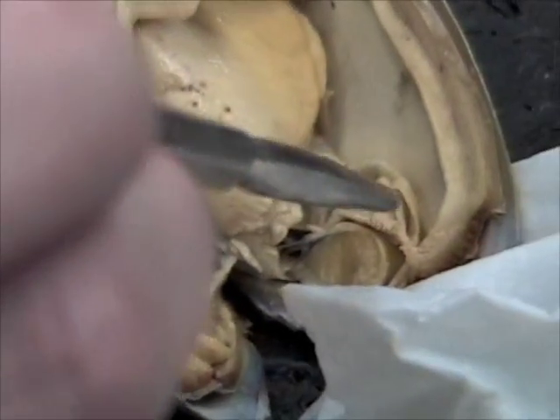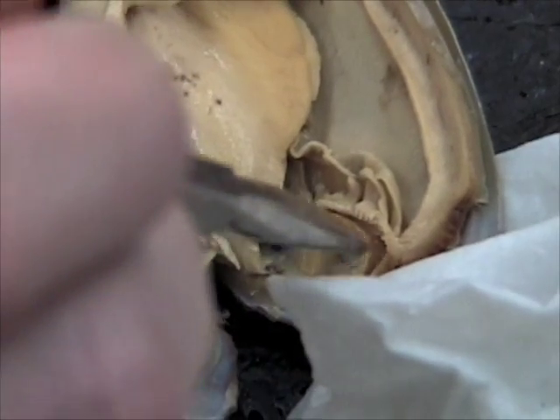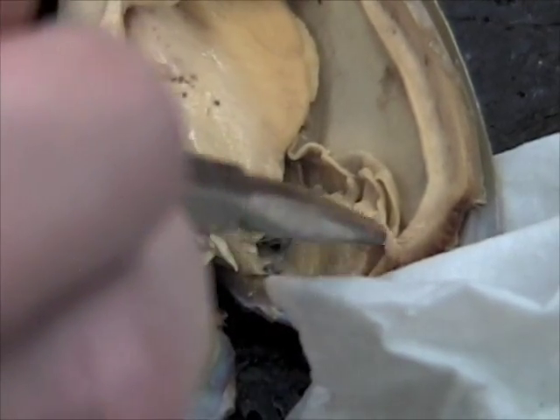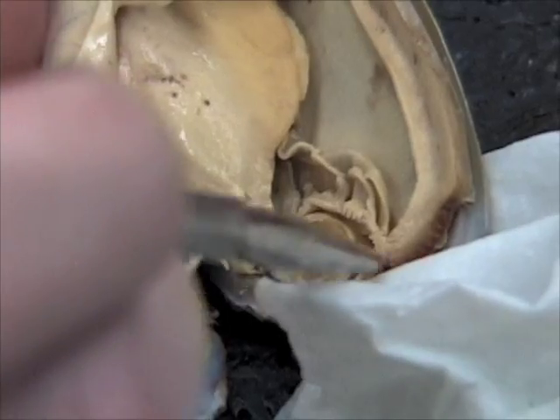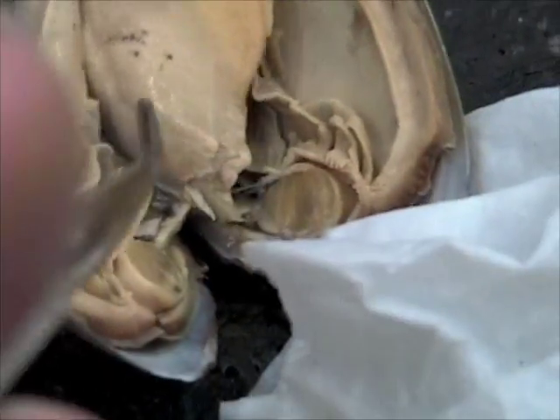Mantle. Here are the gills. Adductor muscles. And what I said about scallops — the adductor muscles are the only thing you eat of scallops. So just this muscle. Yeah, that's pretty much it.